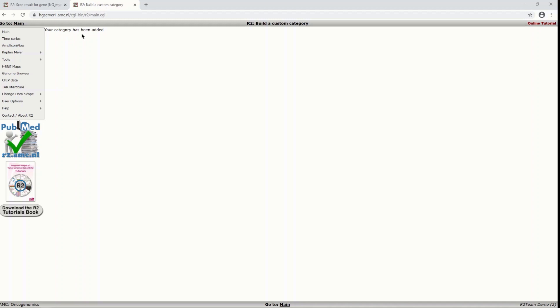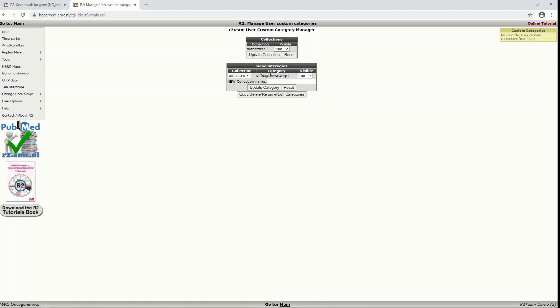And now from now on, you can find it back in user options, categories and manage categories. Here you can see the category that we just generated and that category is available in other analysis as well.